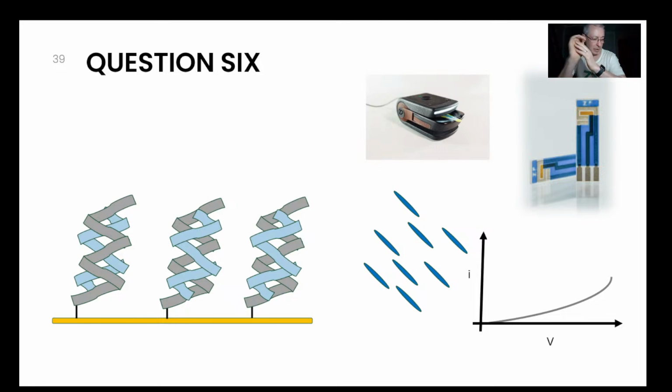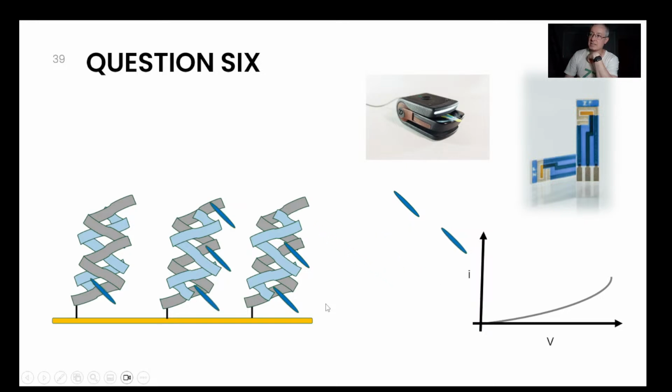Methylene blue, if you look that up, and things structurally similar to it, can intercalate. When you've got a hybridization, you've got grooves in the double strand of the DNA, for example, and these molecules will intercalate. The more hybridization you've got going on, the more intercalation you've got. And if you were following this by square wave voltammetry, for example, then the current would increase proportionally.